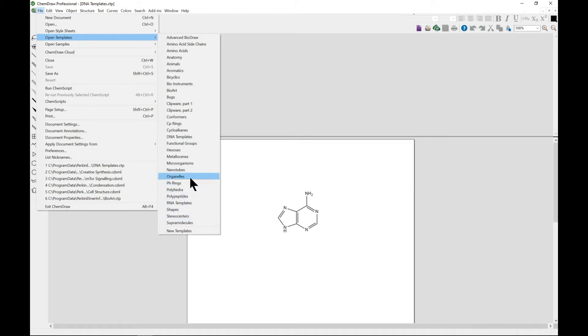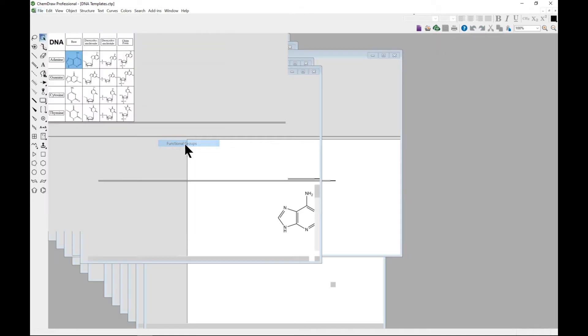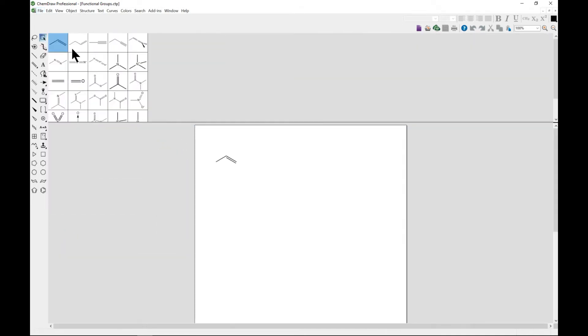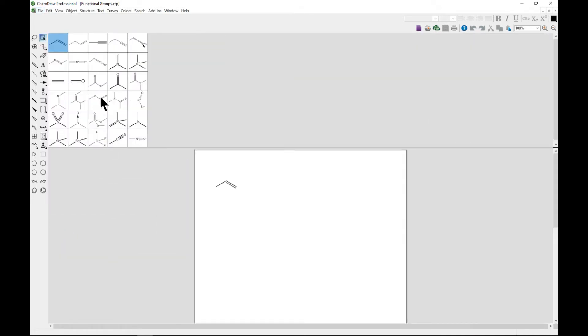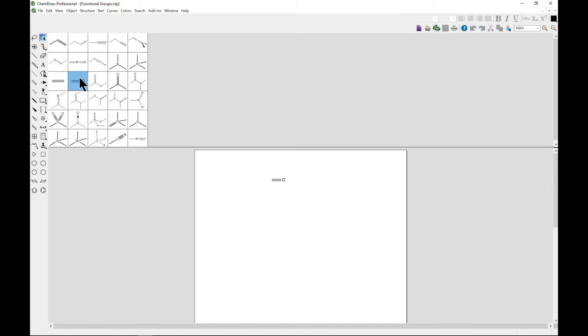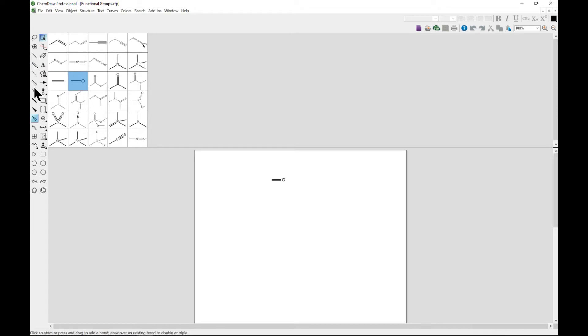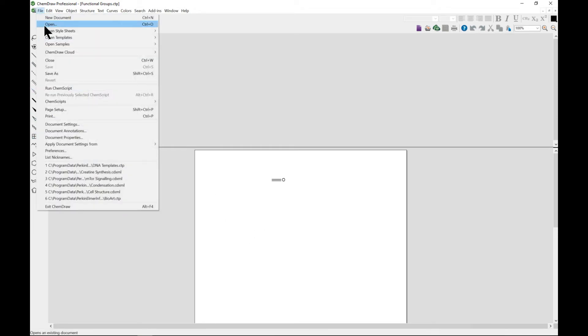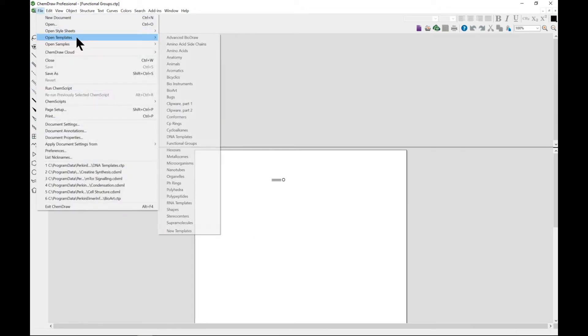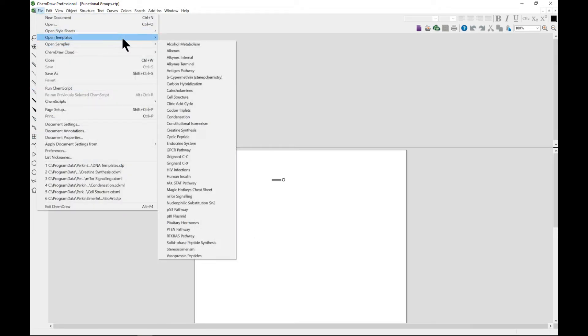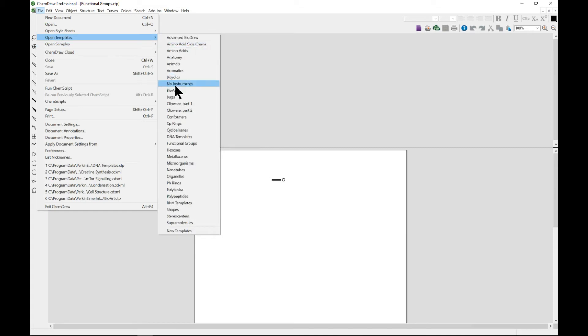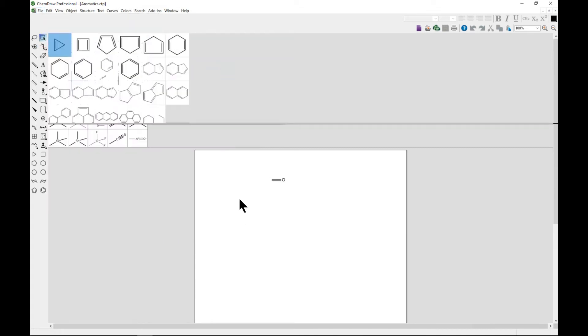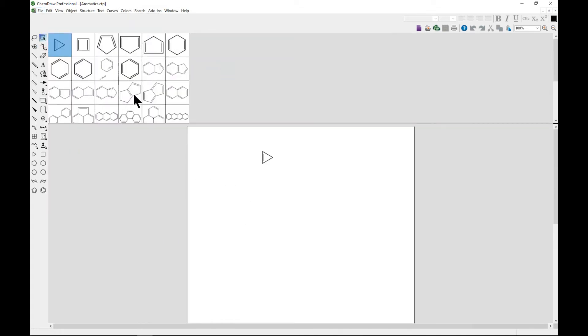If you choose Functional Groups, there you go. You don't have to come in and draw it because it's already provided for you. However, you can also use the main toolbar to draw it.